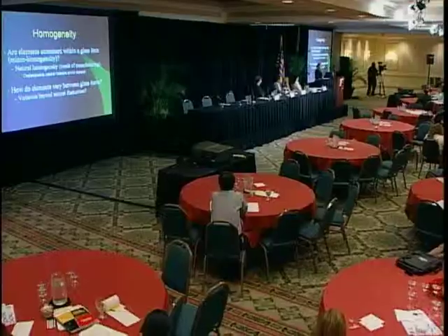This project was focused on looking at homogeneity in glass bottles, and I forget who was talking about it yesterday, but when you're doing comparisons like this, you need to understand the homogeneity within a unit, so within a glass item. For glass, this could be natural heterogeneity introduced by a manufacturing process, which would include contamination or natural variation in the raw materials because it is geologically specific. Especially with glass bottles, you're looking at the use of cullet, which we saw in the video is either from the plant itself or, for glass bottles, taken a lot from post-consumer recycling. So that's going to introduce some variation there.